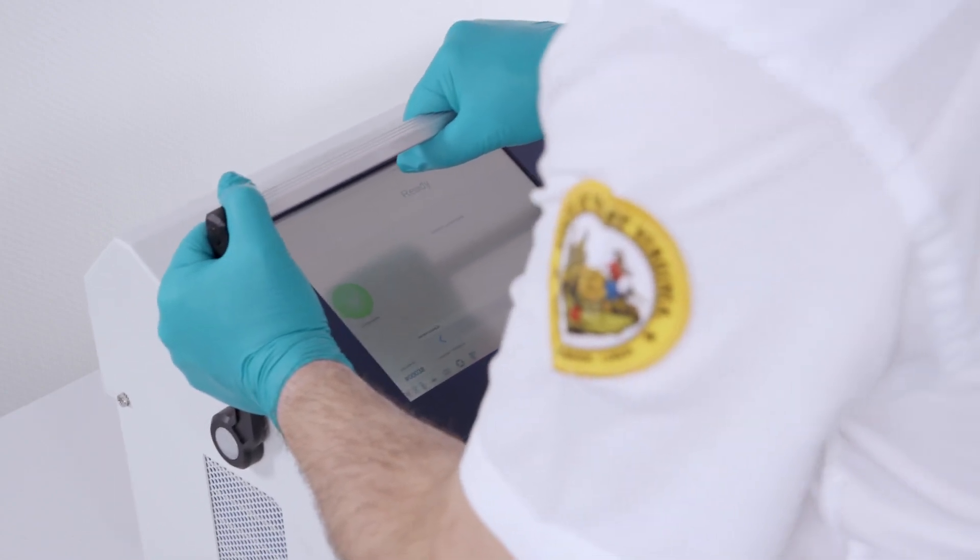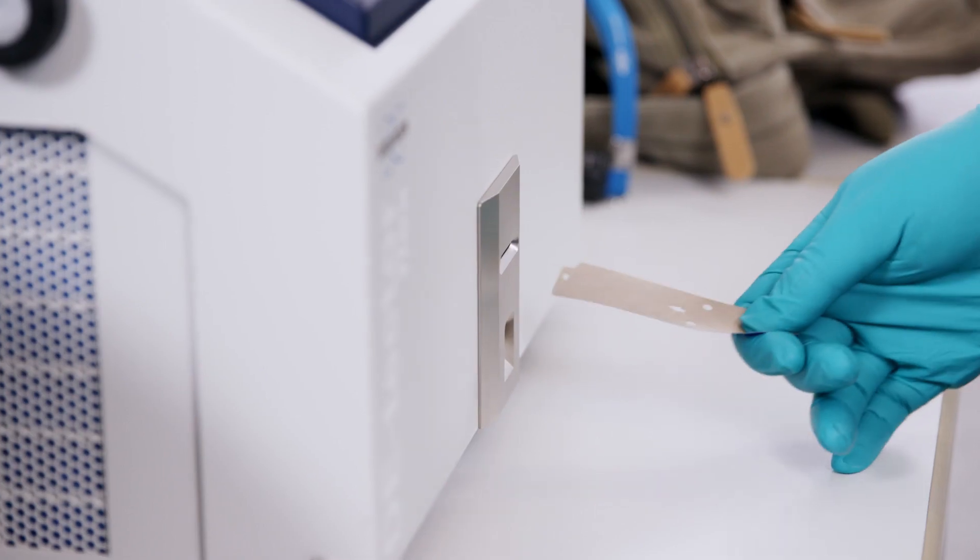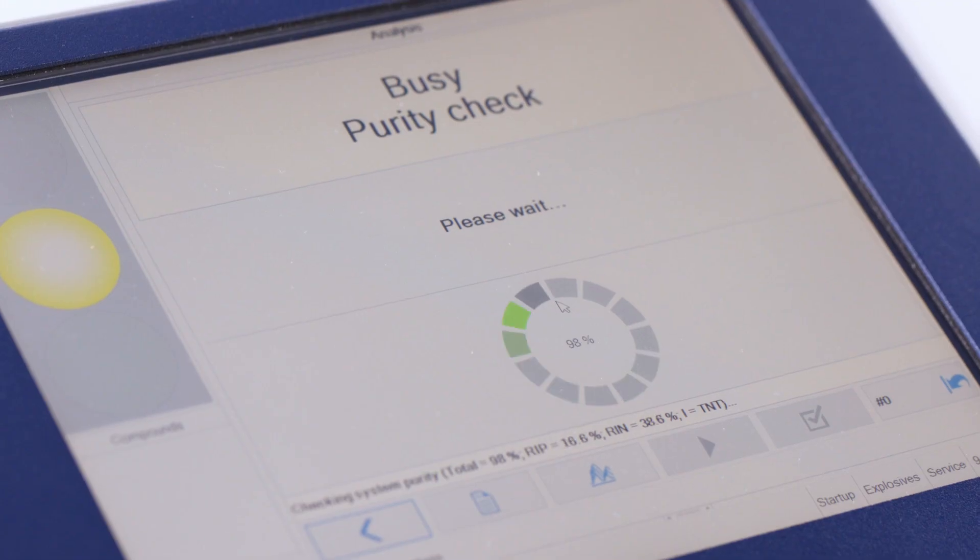The Detector Flex is extremely simple to use. A normal operator can be trained in less than one hour to operate the equipment and software using the touchscreen.